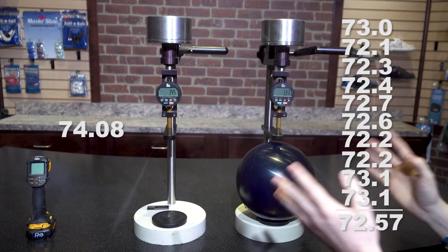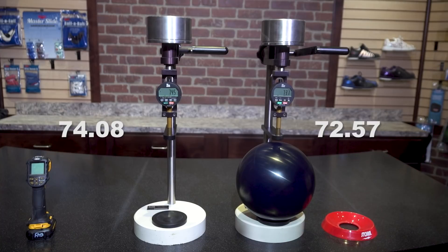So you can see there is a significant difference between the readings of both of these properly calibrated durometers.